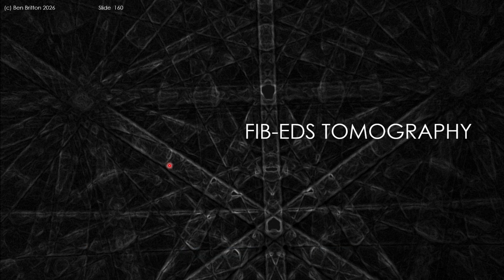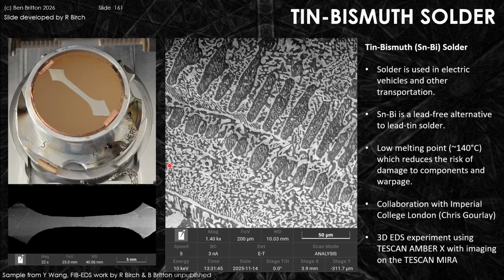So we've now seen effectively FIB, SEM, and FIB-SEM EBSD data. We can also do EDS data, so energy dispersive X-ray spectroscopy. In this example, we're going to use a sample that was kindly supplied by a graduate student of mine in London, Yusen Wang, and this sample contains effectively tin bismuth. Tin bismuth is important for solders, and is one of the examples of a lead-free solder system. It's a low melting point material, which is important. It actually created some tricky difficulties in the FIB-SEM prep, but you'll see it worked out in the end.